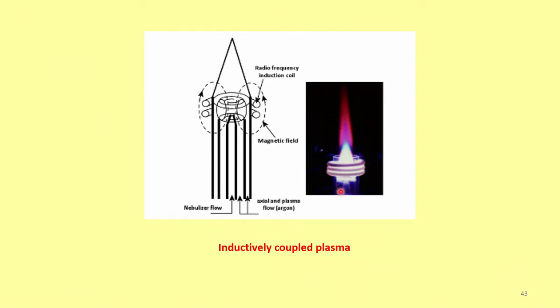The sample comes through this tube from the plasma torch and then enters some sort of a flame, and then there is a violet colored space inside the red one, and that is where the plasma temperatures are reached. Basically the structure is very simple, just like what I had explained to you.